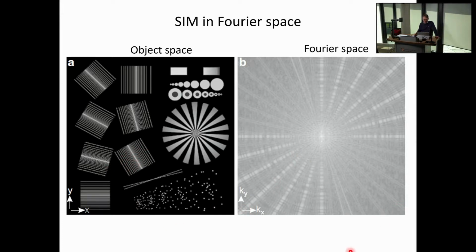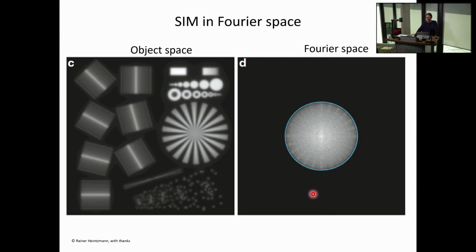And then of course in the microscope, we clip with the optical transfer function, so only this much is passed through at the Fourier plane. So if I go now through the tube lens and synthesize from these frequencies, I get an imperfect image. And of course the image of the object will be degraded because I lose these high frequencies. You can see, for example, that this has resulted in these structures here not being resolved anymore.